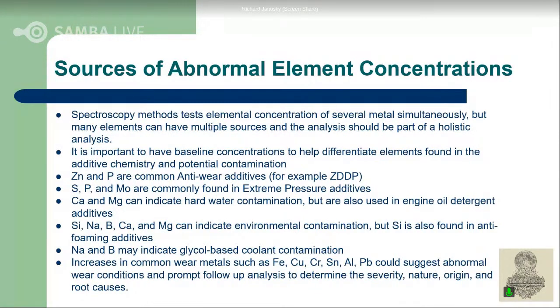Some of those, just reviewing, zinc and phosphorus are common anti-wear additives. For example, that would be ZDDP.